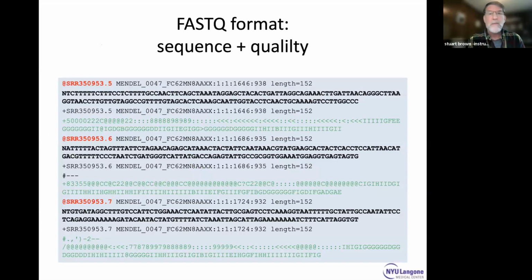You've seen this file format before. Jesse described it in the first lecture. This is called FASTQ, which is the output from Illumina and pretty much every other sequencing technology that's operating today. So for each of those little fragments in the previous diagram, we get a read like this, which is composed of actually 4 lines of text. The first line is a header. It describes the flow cell, something about the reaction, and it tells you how long it is.